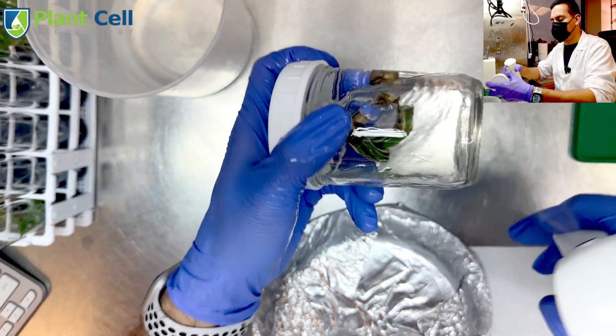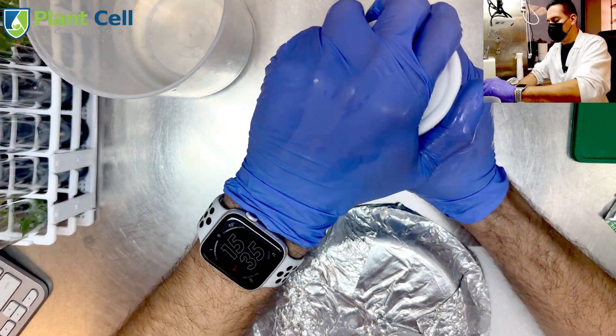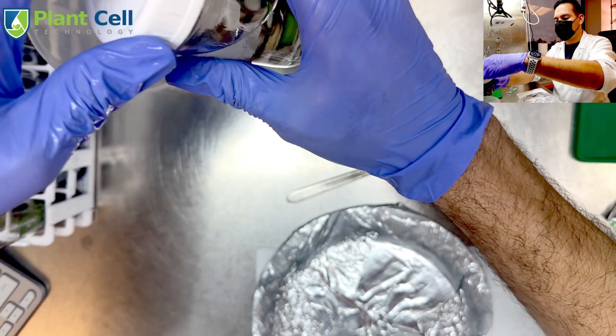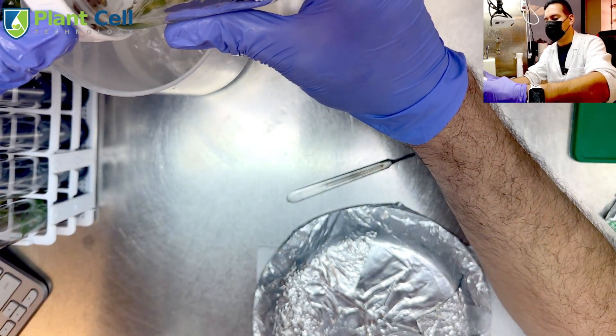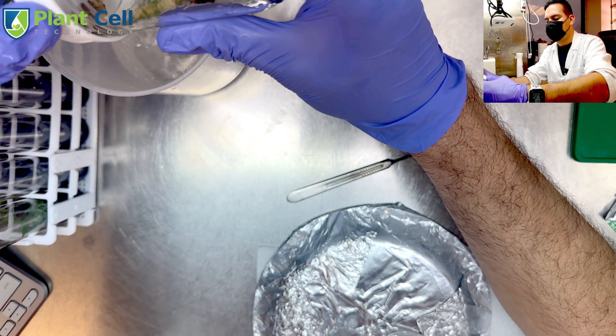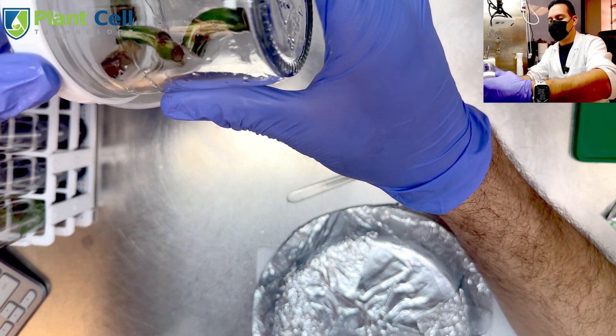Always before you open the jar, spray the jar and your hands with alcohol. Let's discard the water, being careful not to lose any of the plants.